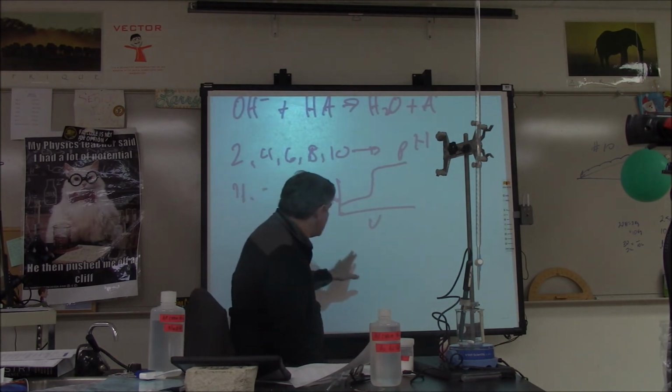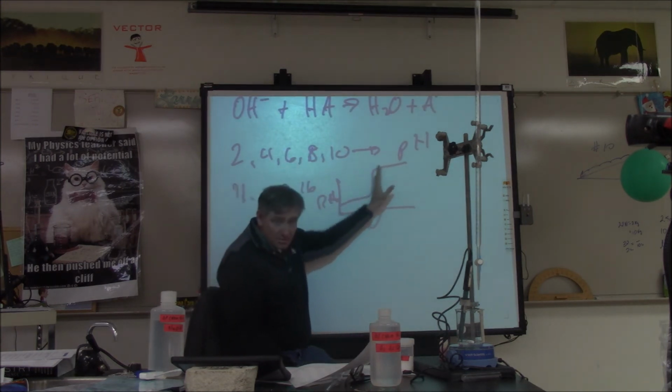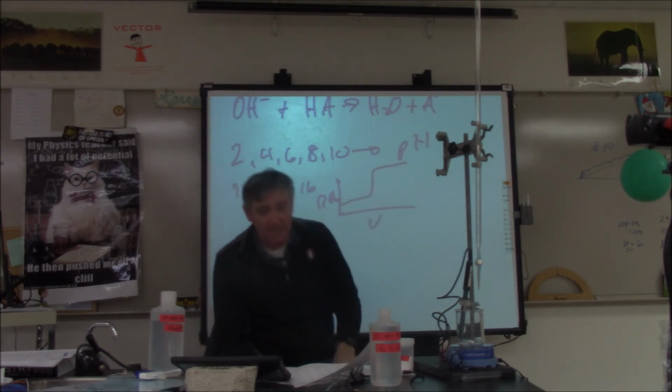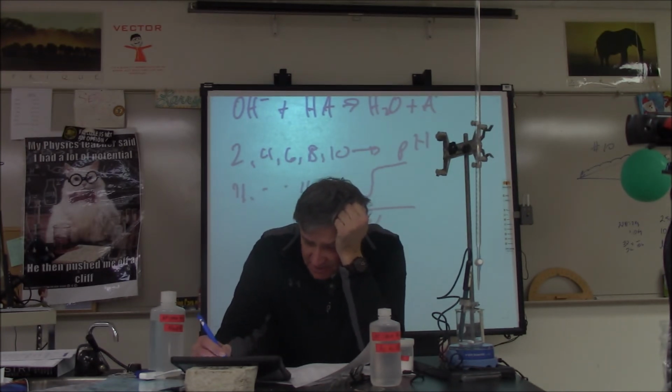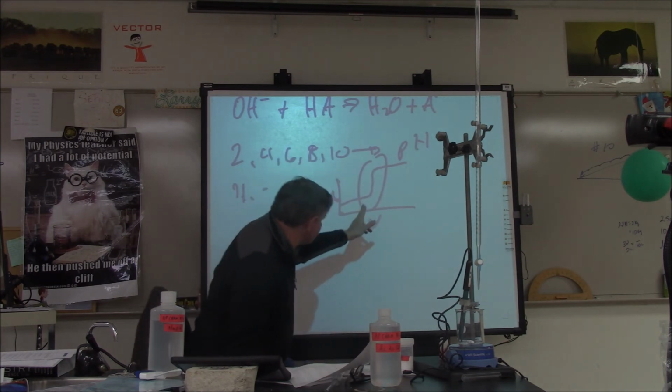So tomorrow you're going to get this. If you want to go ahead and plot this data, you can. What's going to happen is that you're going to have this pH curve. So this is why it's so critical that this data is right.